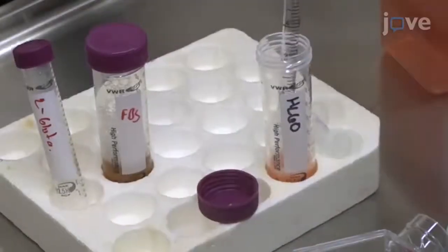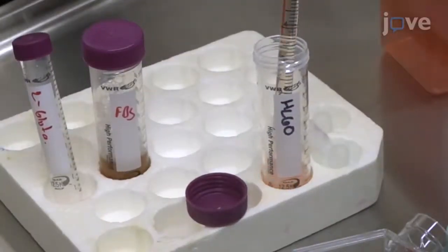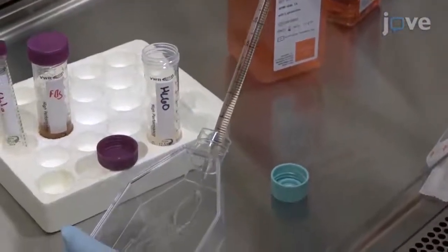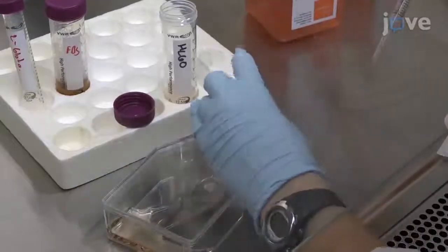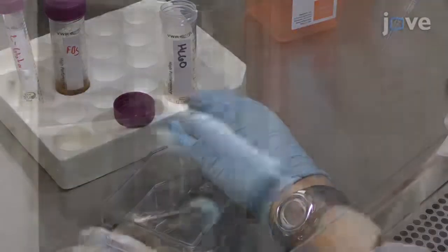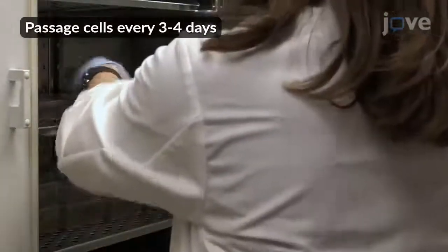For propagation and maintenance of HL-60 cells, culture 5 million cells in 10 mL of HL-60 cell culture media in 75 cm² vented flasks at 37 degrees Celsius and 5% carbon dioxide.